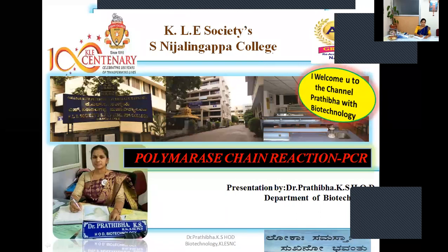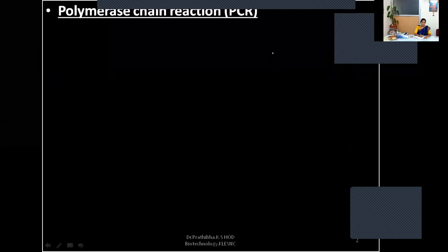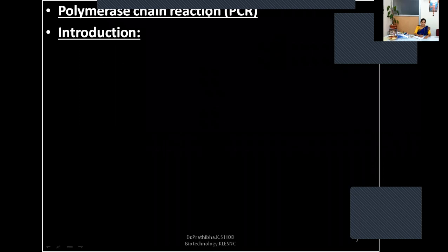Namaste viewers. Today in this lecture talk, I'll be discussing with you polymerase chain reaction. Okay, let us go through polymerase chain reaction. So what is the full form of this PCR?